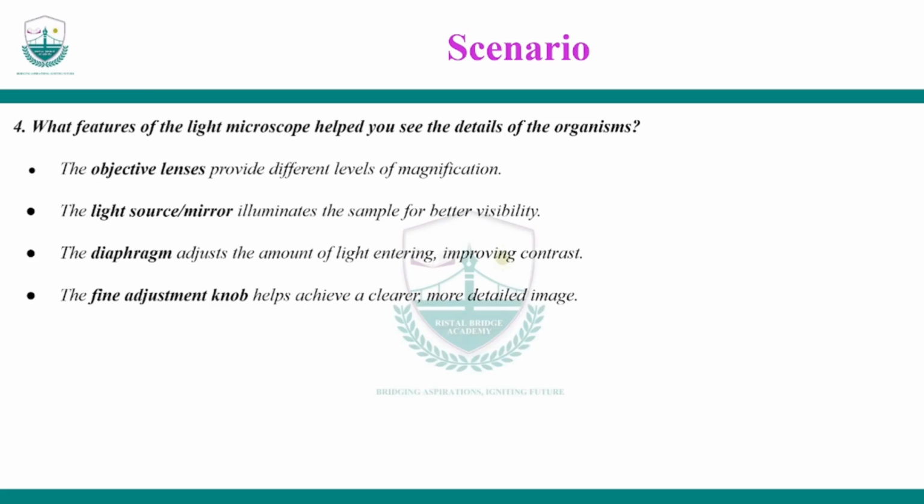Okay, when using the light microscope, you need to use the different parts of this microscope appropriately, because this microscope is basically working as a system. If you don't align things quite well, that is, if you don't make sure that there is sufficient light entering into the sample, it's going to be very difficult for you to look at the samples in detail. And then you need to move the lenses, and of course, like we have just said, you start with low magnification, then go to higher magnification.